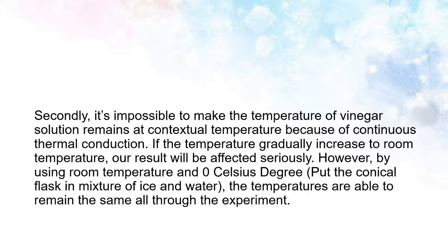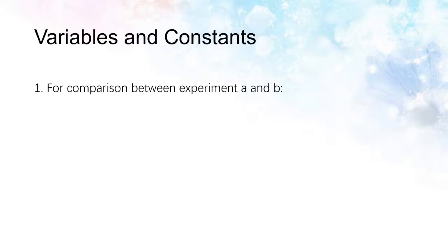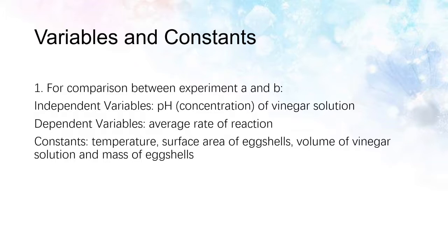However, by using room temperature and 0 Celsius degree, the temperatures are able to remain the same all through the experiment. Independent variables, dependent variables, and constants of each comparison are shown here.